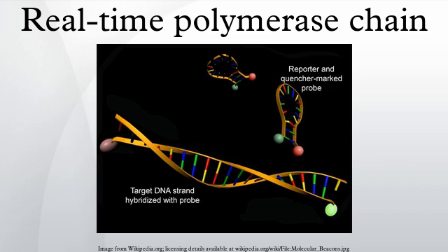Quantitative PCR with double-stranded DNA binding dyes as reporters. A DNA binding dye binds to all double-stranded DNA in PCR, causing fluorescence of the dye. An increase in DNA product during PCR therefore leads to an increase in fluorescence intensity and is measured at each cycle, thus allowing DNA concentrations to be quantified. However, dsDNA dyes such as SYBR green will bind to all dsDNA PCR products, including non-specific PCR products. This can potentially interfere with, or prevent, accurate quantification of the intended target sequence.